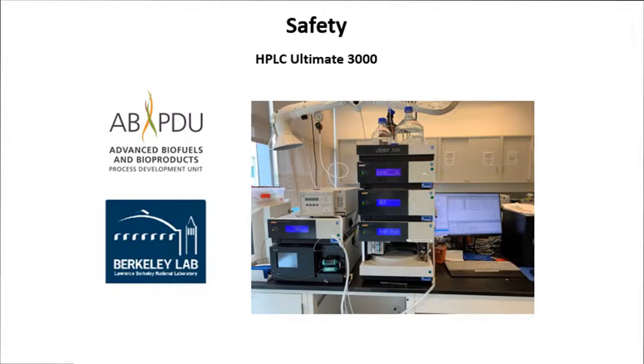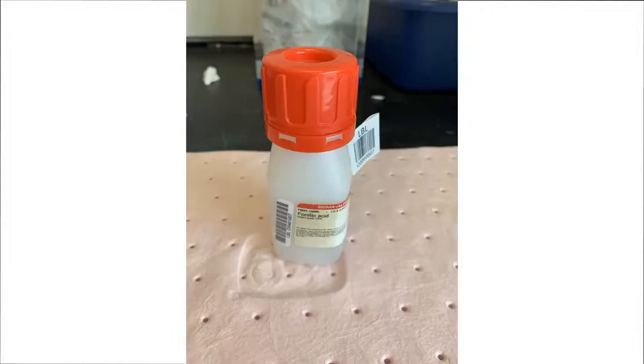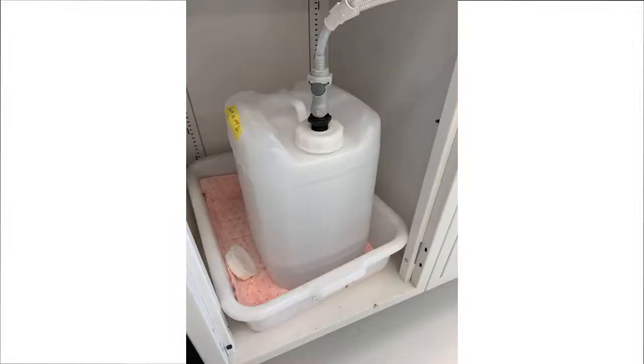First, let's review some safety considerations for the HPLC system. There are two main safety factors to consider when working with the HPLC system. The first is that eluents often contain acids, such as sulfuric acid and formic acid. Be sure to have a waste container to collect all waste and dispose of your waste properly.